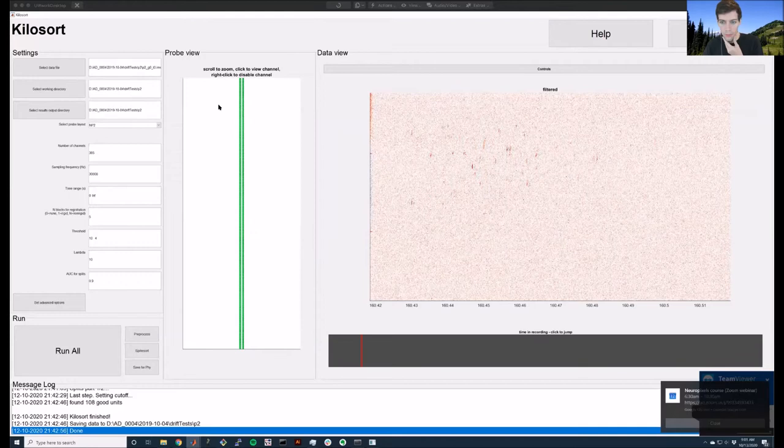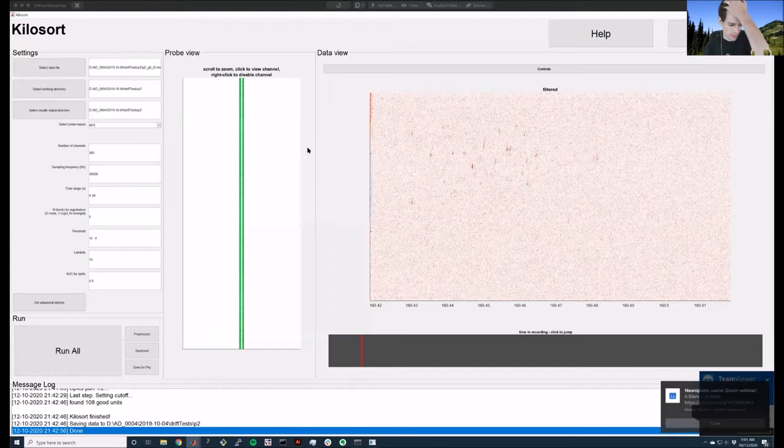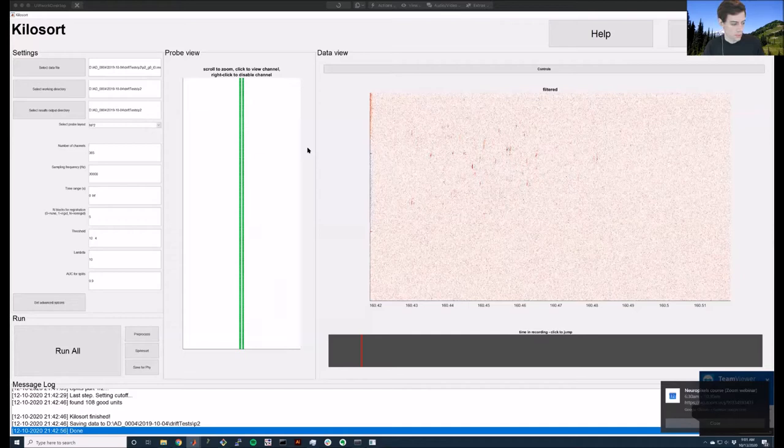In this part of the session we're going to go through a bit more of a hands-on with the Kilosort GUI and running Kilosort and with the PHY GUI, thinking about what kinds of things you might see during using PHY to curate your spike sorting. This is going to be picking up from what Maria has already told you and going into a bit more detail and more hands-on.